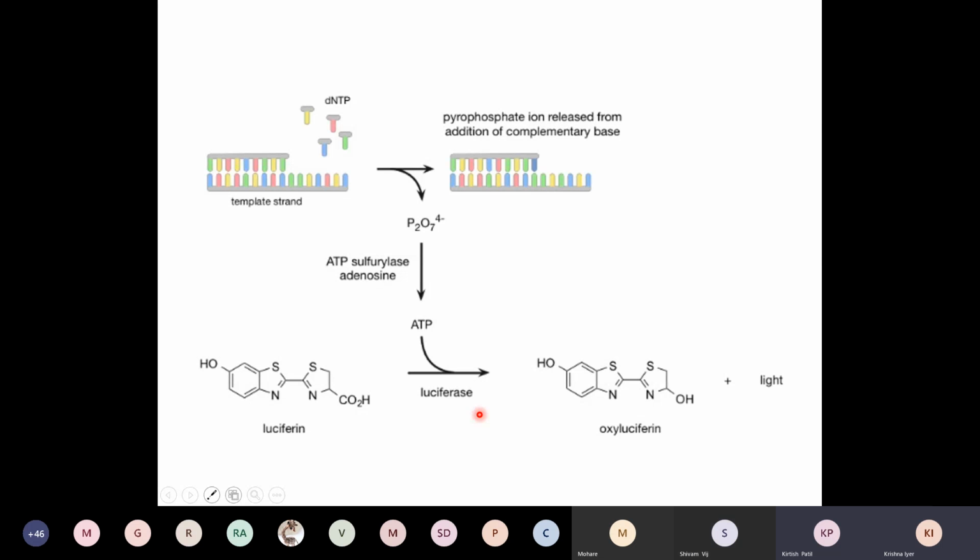Yes, sir. Sometimes when you're little, you go and catch these fellows and put them in a little bottle, and when you cap it at night and look, when they're flying, they give out this little light. This light that they give out is because they have this enzyme called luciferase, and this luciferase in the firefly converts luciferin, which is produced by the fly itself, to oxyluciferin, and when this reaction occurs, it generates a little light. And you see that light as it comes out.